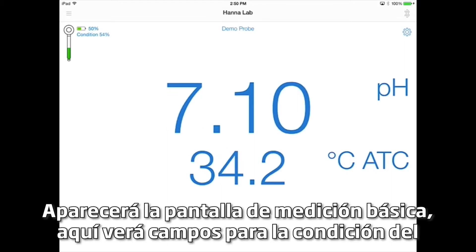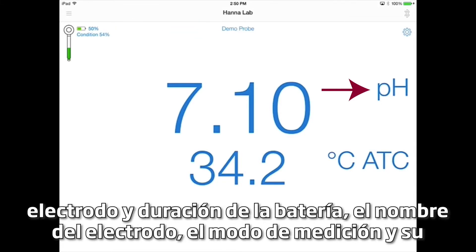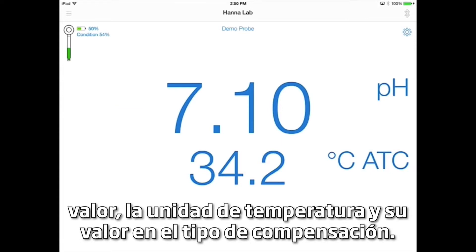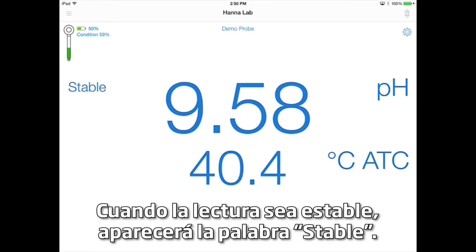The basic measurement screen will appear. Here, you'll see fields for the electrode condition and battery life, the electrode name, the measurement mode and its value, the temperature unit and its value, and the compensation type. When the reading is stable, the stable field will appear.